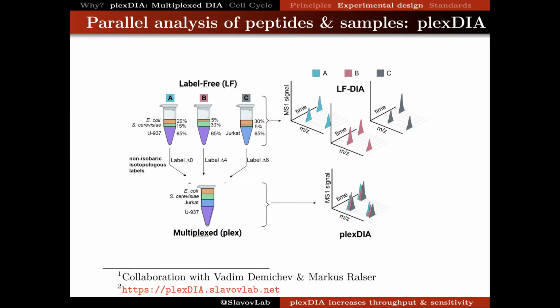And in developing this method, we collaborated extensively with Vadim Demichev and Markus Ralser. In particular, we used the DIA-NN software that they have developed for data independent acquisition analysis. And together with them, we built in additional features to enable this multiplex analysis. So let's take a look at the results.